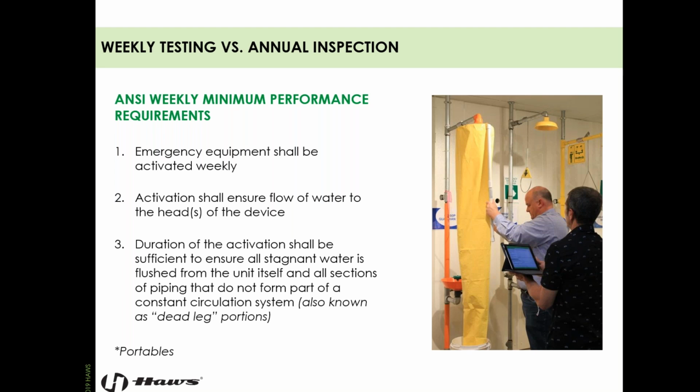On portable equipment, all that is required is that you visit the unit, open the tank, and ensure that there's enough water in the tank. Or if it's a pressurized unit, ensure that it's properly pressurized via the gauge, and maybe give the tank a kick to make sure it's actually full of water.